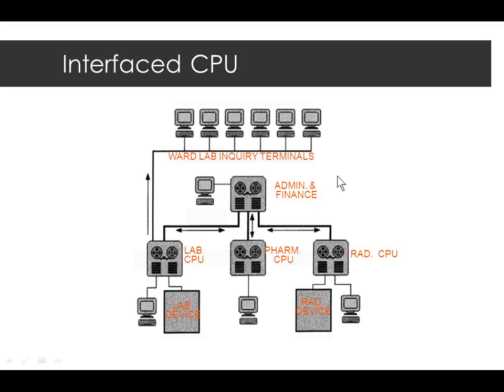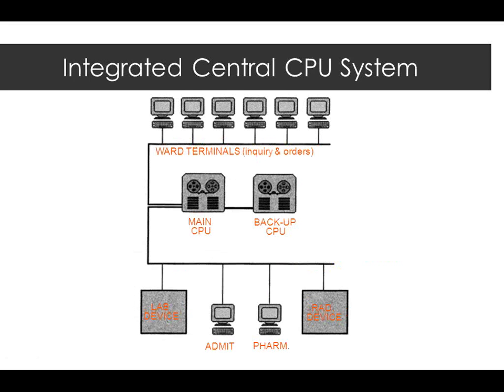Was this before HL7 came out? Actually, this was during HL7. Most of these things functioned on an HL7 standard, but these systems still didn't talk. There was no centralized system that they all talked to and then went out. Now, you could replace something and have, say, an interface engine where all of these systems could interface and then run out to one set of terminals. Okay, a different way of doing it.